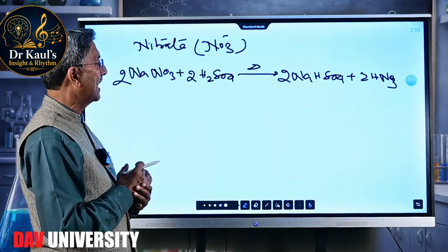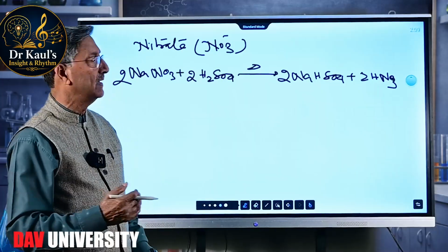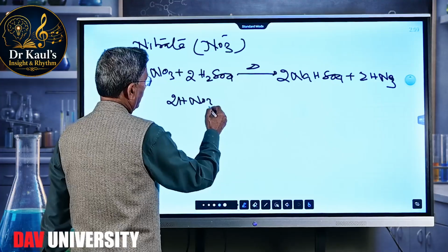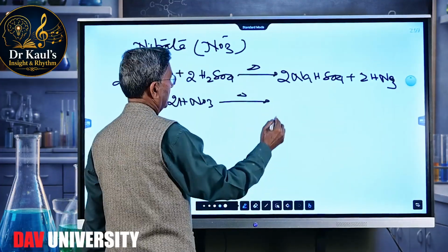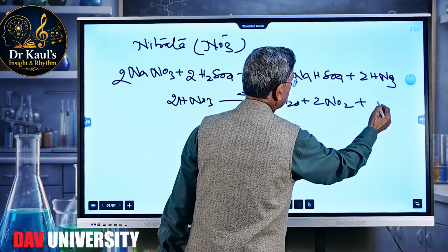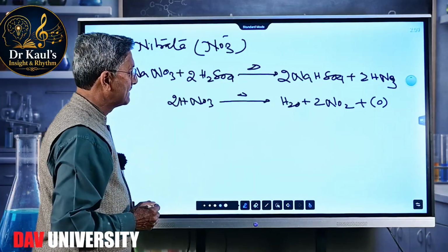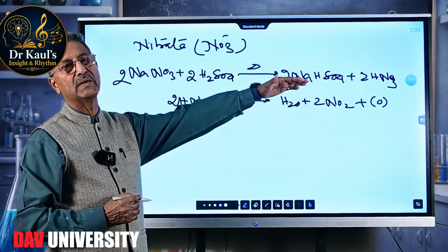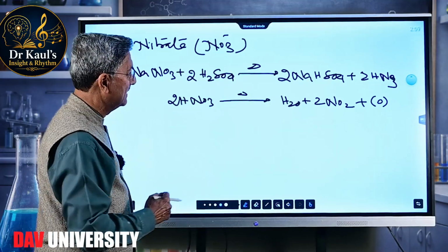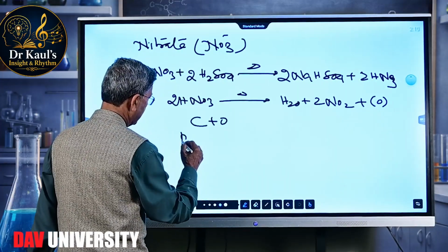Carbon. So that carbon accelerates or promotes the dissociation of HNO₃. You see, this is HNO₃. Upon heating, it will give us water plus 2 NO₂ plus 1 nascent oxygen. And if some oxidizable material is present, this reaction will be favored, or its rate will be increased. And now this nascent oxygen combines with carbon. This is the paper pellet.